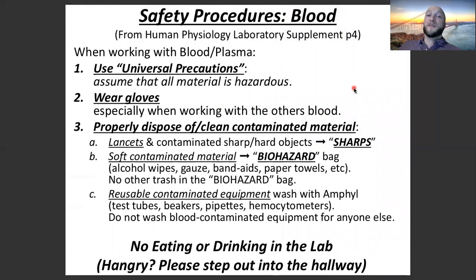Safety first. We are in a virtual setting right now. We are not performing this experiment live, but I still think it's important to go over precautions and safety procedures, because one day we might be back in lab. We'll see. All right, so this is a blood lab.